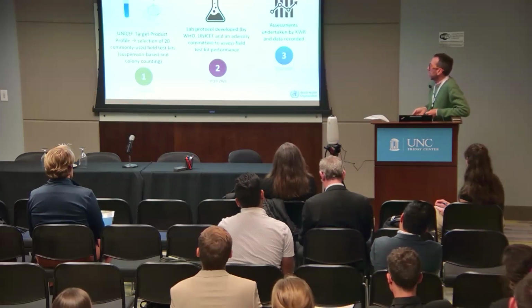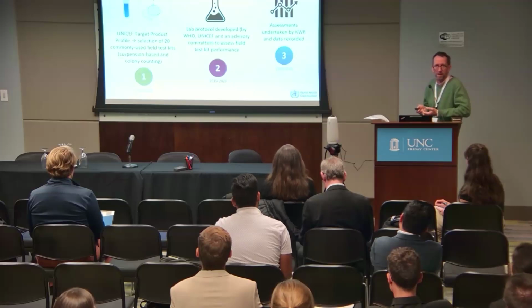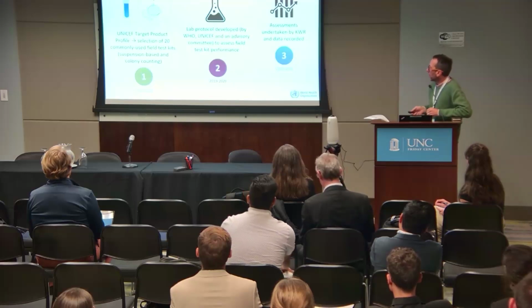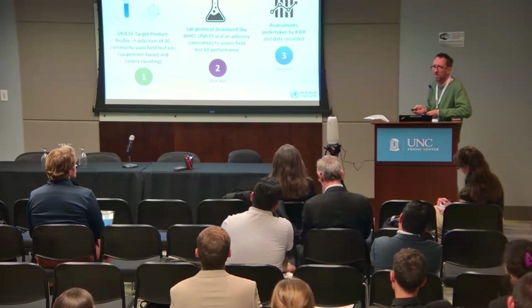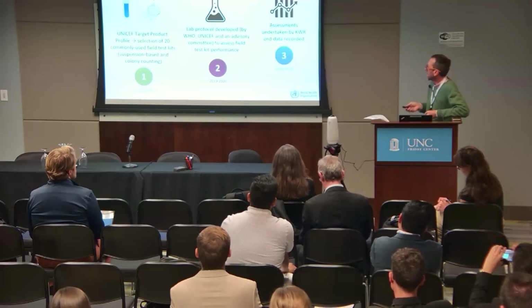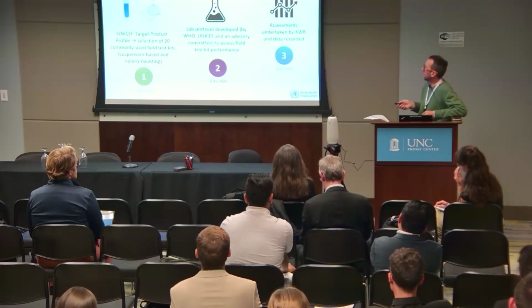That led us to shortlist 20 products that we were interested in assessing because we thought they had promise or were already being used, and we wanted to make sure that they were performing in terms of accuracy and precision. We worked for a couple of years to develop a lab protocol from WHO and UNICEF, but also a technical advisory group. Some members of that have been at this conference. And then we contracted an independent laboratory in the Netherlands, KWR, to record, compile, and analyze the data.